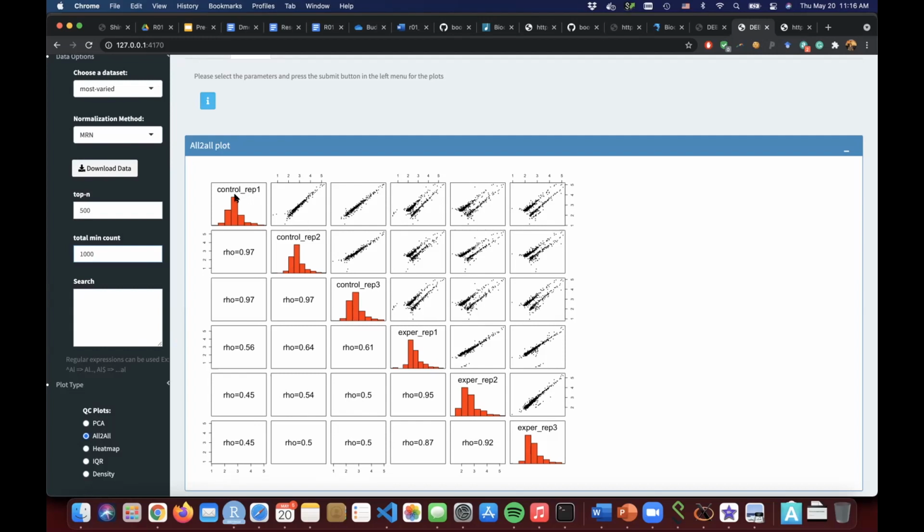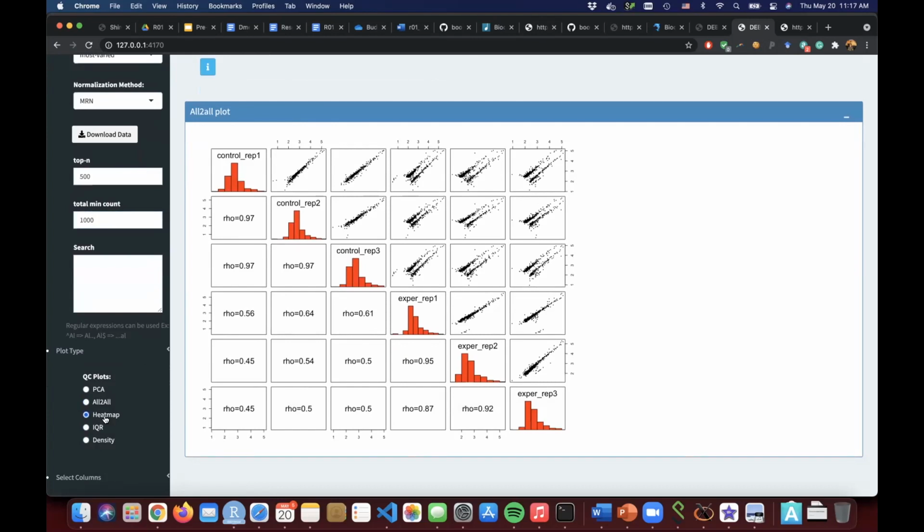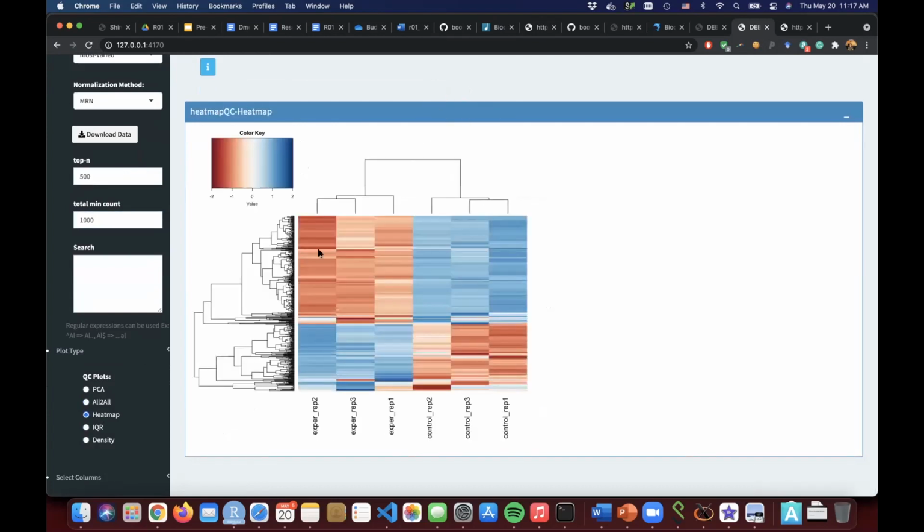And when you look at the biological replicas now, see 97, 97, even though these are the most varied genes between these two samples, the correlation is still extremely high and very replicable here, you see. And here, the correlations are lower. And even when you use all detected genes after filtering, the correlations were 97, 96. Now it goes down because these are the most varied genes. So you selected the genes you want to work on, and you can actually create this heat map by using this.